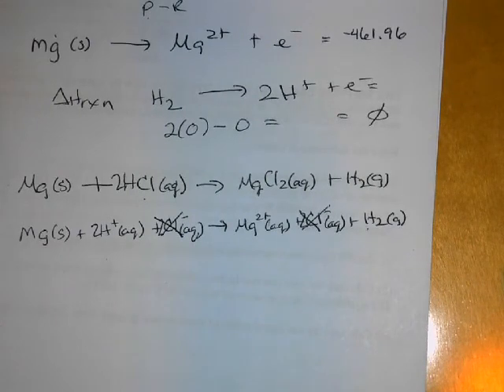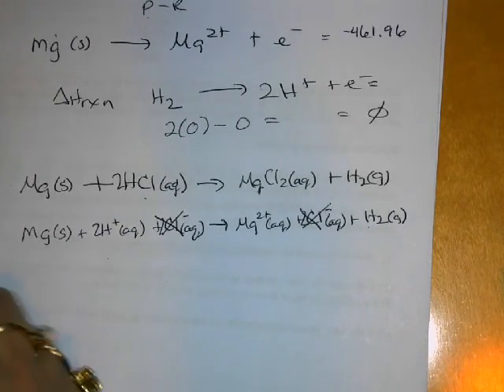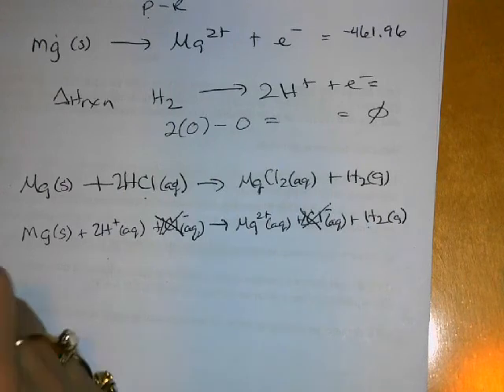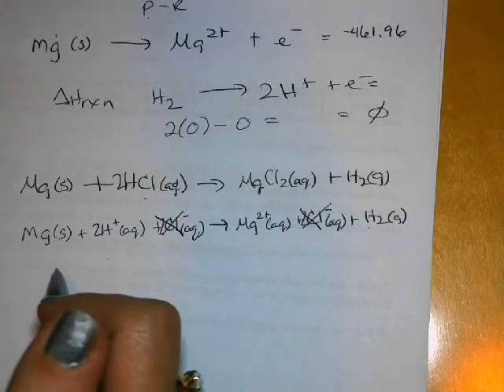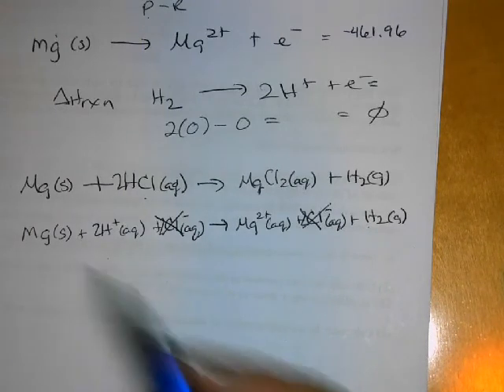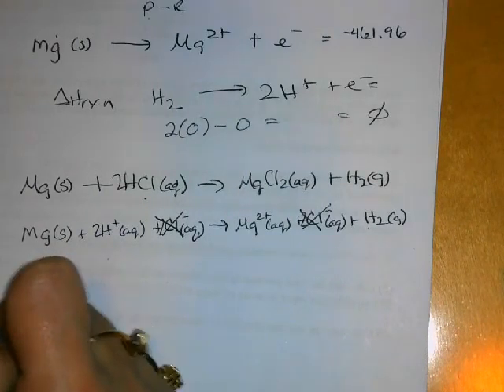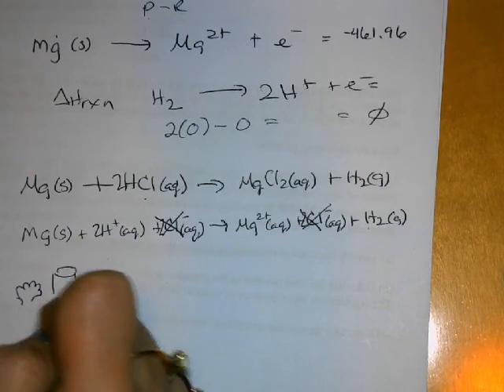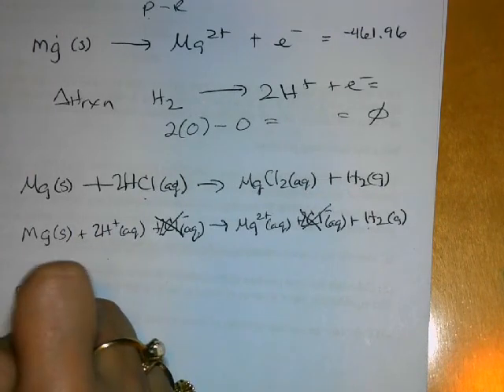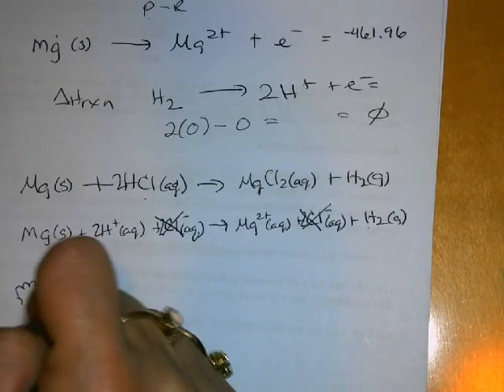Okay. So then it says for the reaction of Mg plus HCl, what would you predict? Endothermic or exothermic? Honestly, get your brain primed. Oh no, I'm sorry. 6. How could we qualitatively determine endothermicity or exothermicity in a chemical reaction? Okay, if your hand goes on it, that's your hand, and it has heat energy entering it, that means it had to have exited the system, and this is exo.